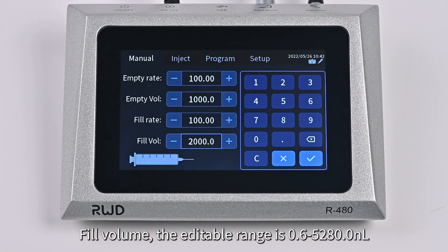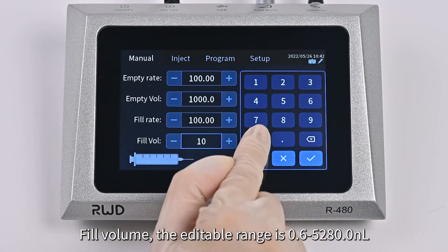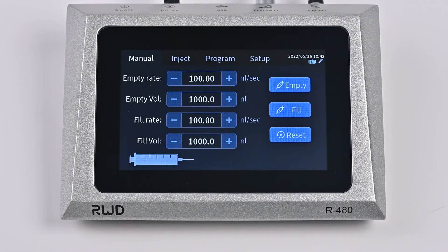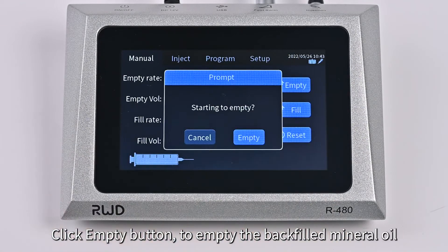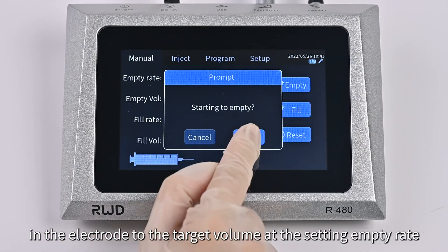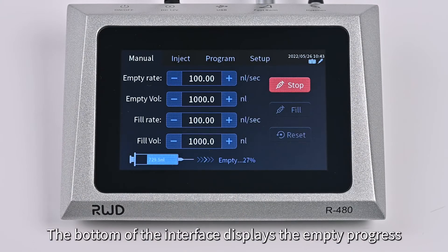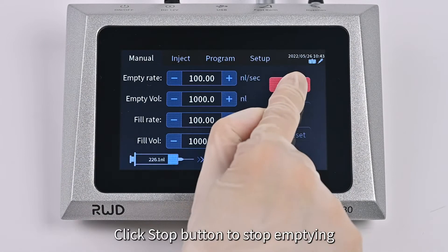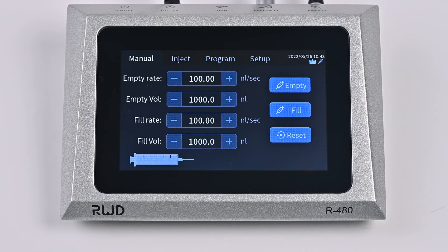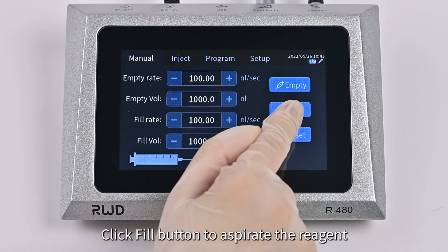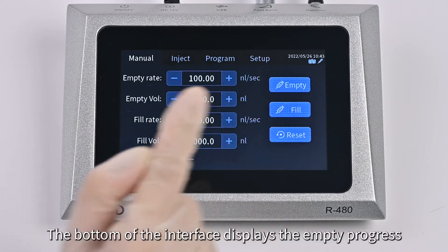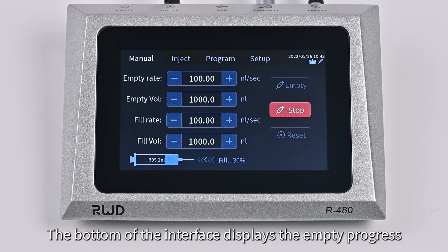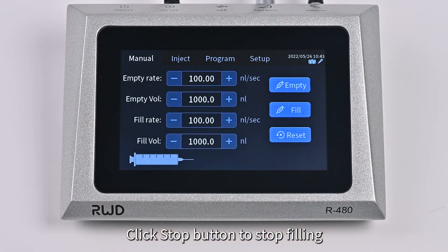Fill Rate: the editable range is from 0.02 to 200 nL per second; the minimum step is 0.01 nL per second. Fill Volume: the editable range is from 0.6 to 5,280 nL. Click the Empty button to empty the backfilled mineral oil in the electrode to the target volume at the set empty rate. The bottom of the interface displays the empty progress in real-time. Click the Stop button to stop emptying. Click the Fill button to aspirate the reagent at the fill rate and fill volume into the glass electrode. The bottom of the interface displays the fill progress in real-time. Click Stop button to stop filling.